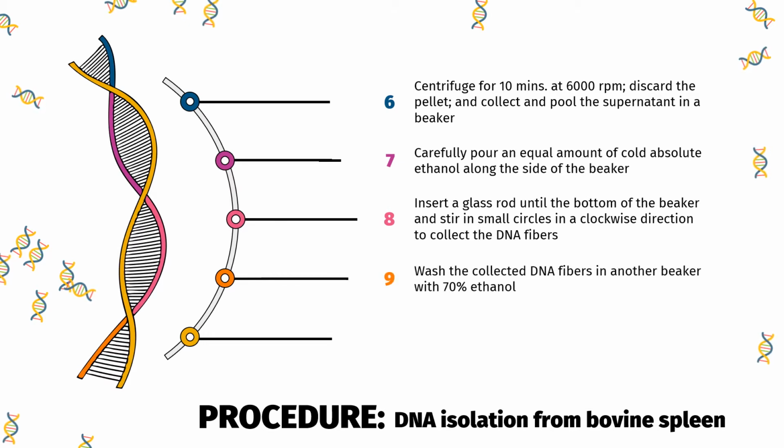In another beaker, wash the collected DNA fibers with 70% ethanol. And finally, resuspend the DNA fibers in 10 ml of distilled water, label properly, and store at 4 degrees Celsius.